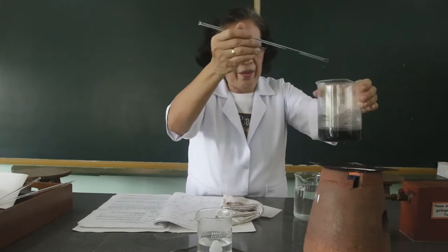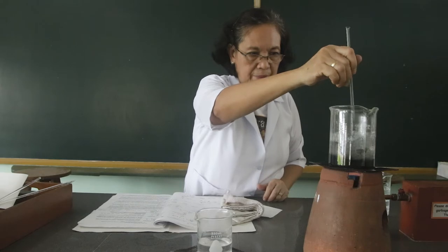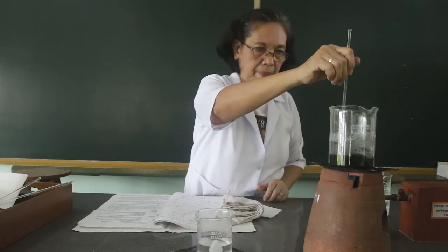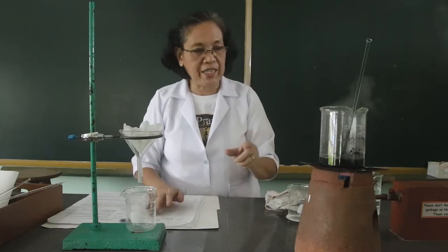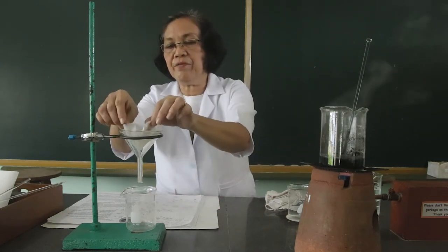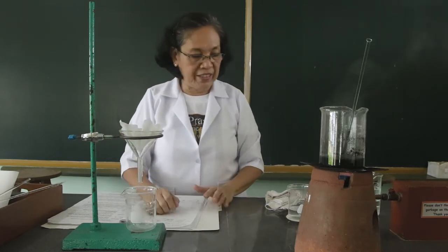We will boil this for a few minutes while stirring. Since the mixture has already boiled, we are going to filter this using a fluted folded filter paper and we are going to collect the filtrate.